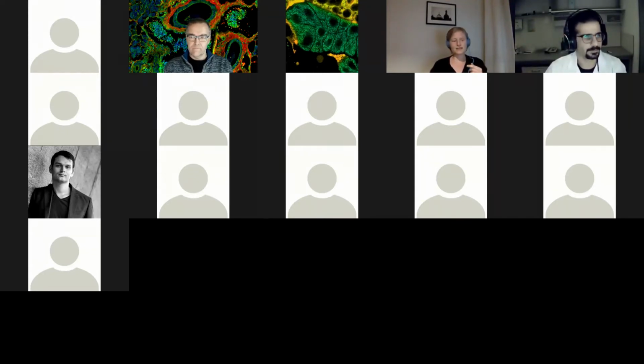But yes, the discussion is in the field, and you can also try to simulate, for example, if you know which protein your NADH interacts with, then of course you can simulate this in vitro also. But in a living cell, NADH interacts with numerous different proteins, enzymes, and so on. So you always see a mixture, a mean of these individual contributions of different protein interactions. So I guess you can always try to simulate this to a certain extent. I don't think you get to perfect values.